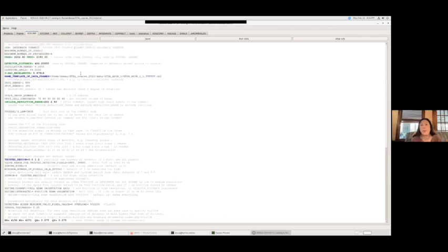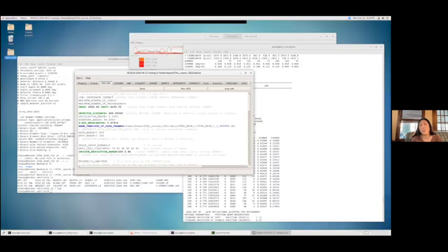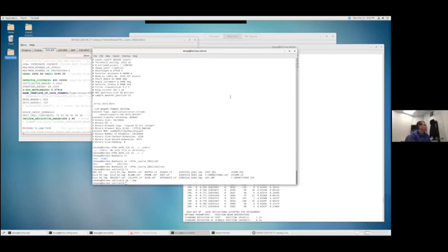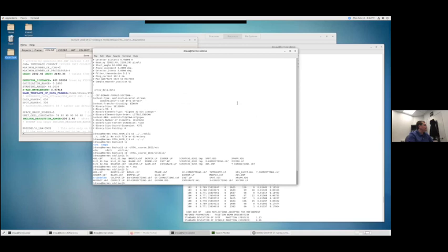And Catherine also asked, what are the output files from XDS? Like, can you give the extensions for which ones are the log files and such, like if we were looking at them not through the GUI? Yeah, so if I'm looking at not through the GUI, okay, this is what ends up being in the directory after I run XDS.